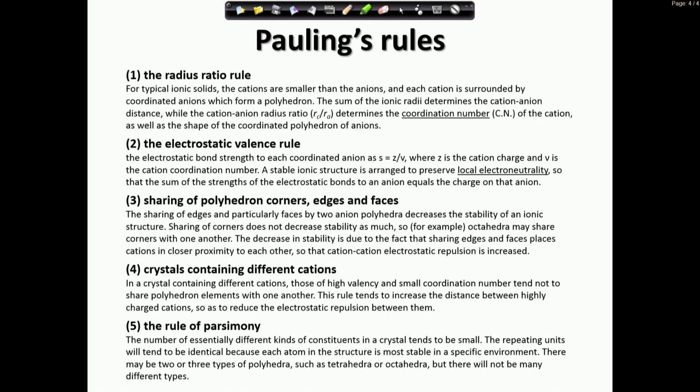At the end of this little crystallographic refresher, we added a few slides on a little different topic, and that's not the basic crystallography, but let's say basic crystal chemistry for inorganic structures, because this is something that you need quite a lot when solving and interpreting the structures. Once we get the structure, we need to know if the structure is reasonable or not. We need to know if I see two oxygen atoms which are 1.2 angstroms apart, if that is possible or if it's not possible.